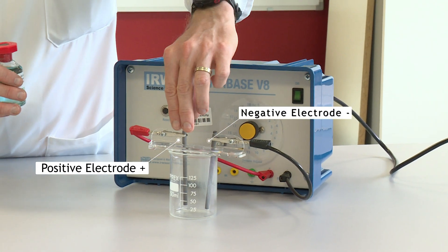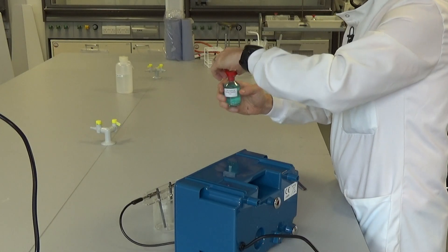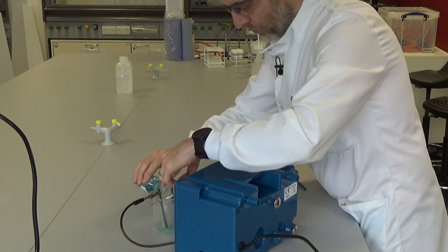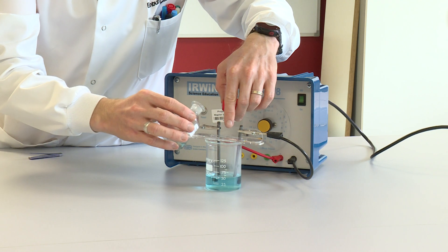I can then add my copper chloride solution to the beaker. You can see the copper chloride solution is a blue coloured solution because of the blue coloured copper ions that are in there.